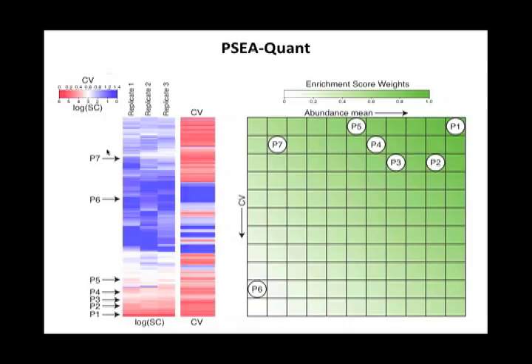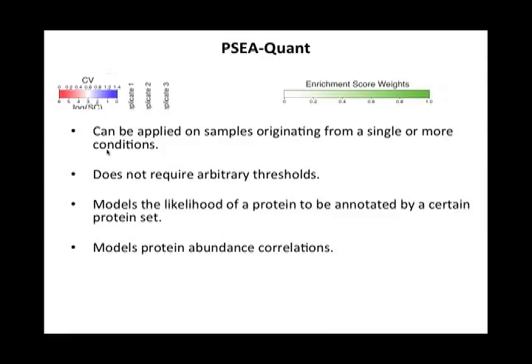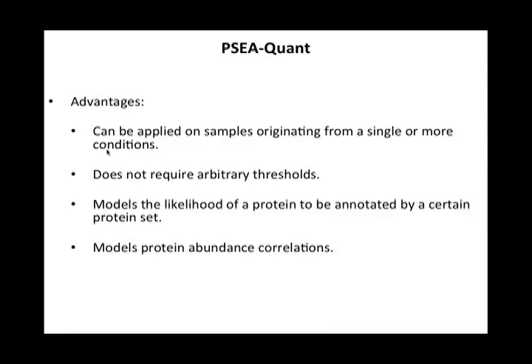So protein sets that are enriched with proteins of high abundance and low coefficient of variation will obtain a high score. We then have a Monte Carlo sampling procedure that assesses the statistical significance of the enrichment scores that are obtained for each protein set. So I'm not going to go into the details of that analysis because that was presented last time, and as was said in the introduction, can be viewed on the internet or referred to in the JPR, the Journal of Proteome Research paper.